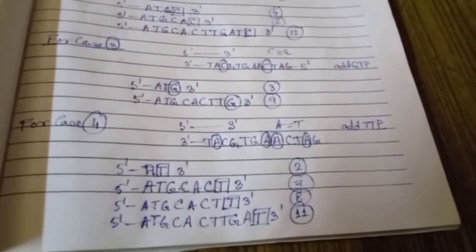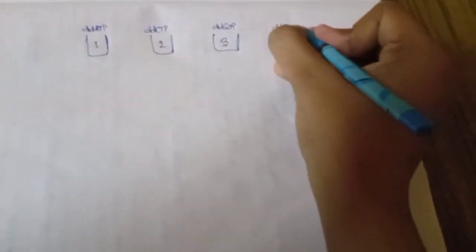Please follow our instruction. Now, having the fragments, we have to separate the DNA fragments according to their size by gel electrophoresis. But before running the gel, we have to denature this newly synthesized fragment from the template strand, then we run the gel electrophoresis.